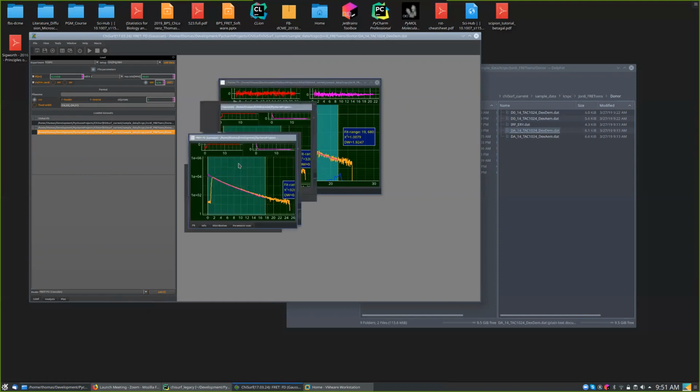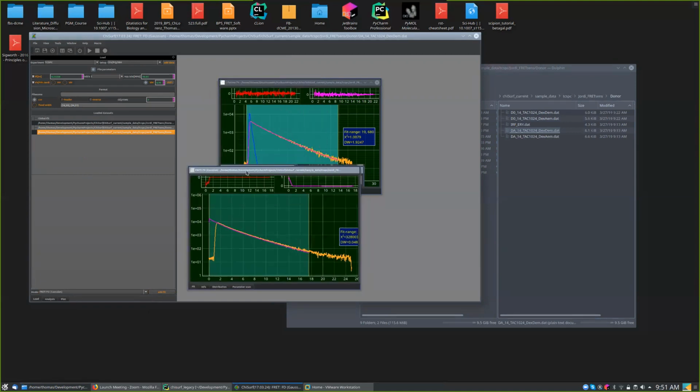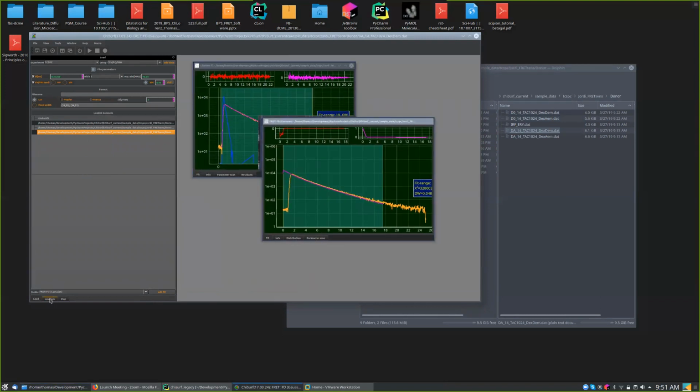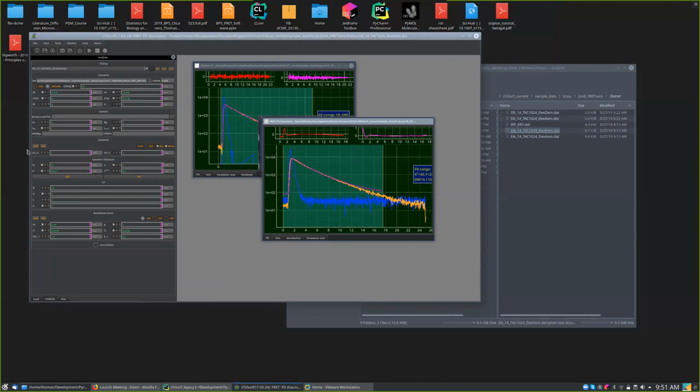Here again, we have to do the same. We have to set a response function. It's again the same response function, with some starting value for the background of the response function. I delete the rotational times and I just keep one donor-only distance.